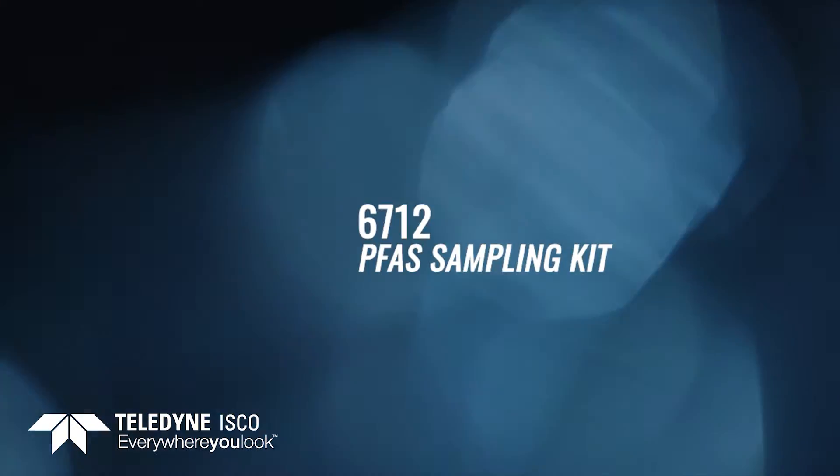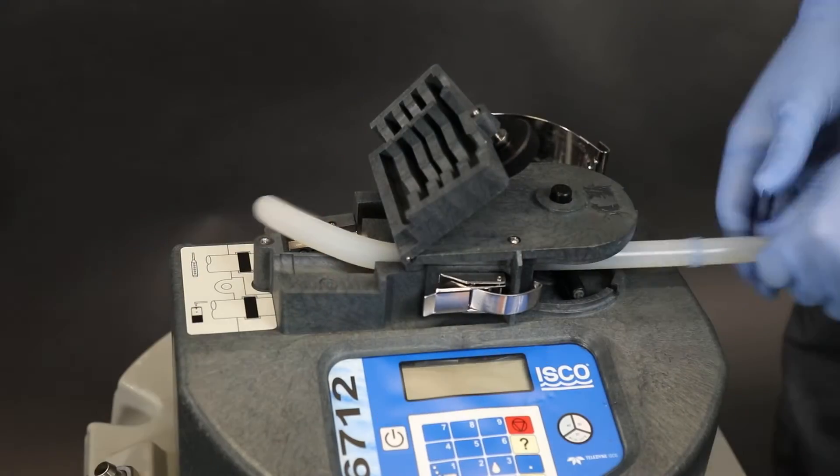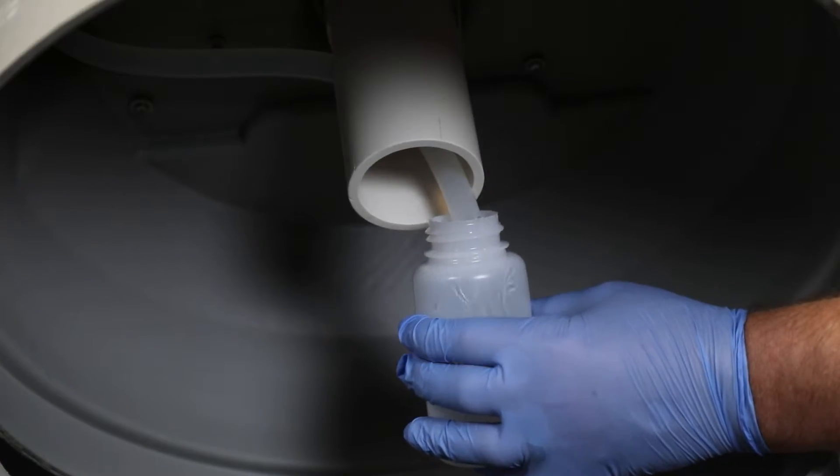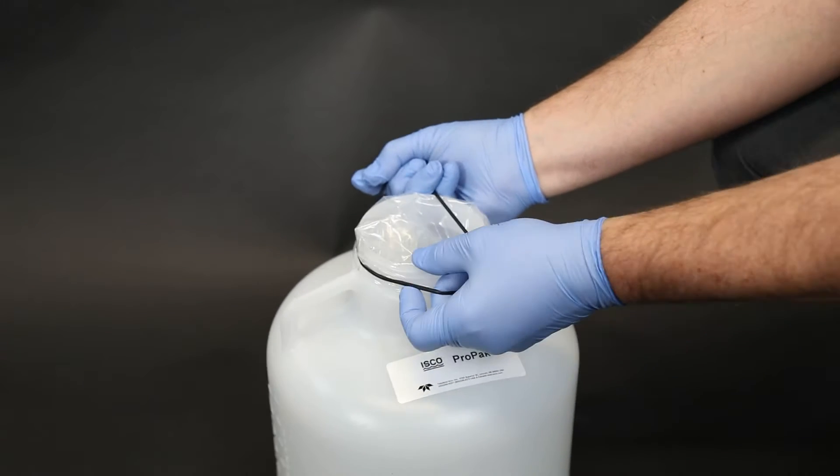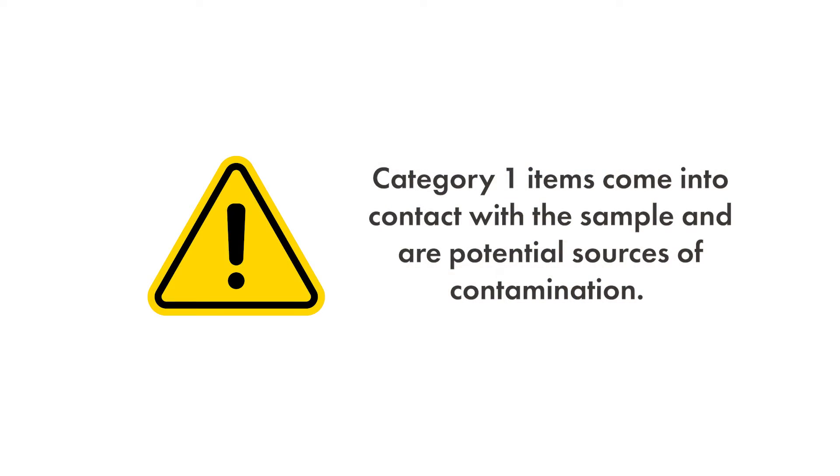This video guide will help you set up your 6712 sampler for success using Teledyne Isco's new PFAS Sampling Kit. Please refer to the PFAS Sampling Kit manual for more information, including how to better avoid PFAS contamination. This video will explain how to install and use Category 1 items.